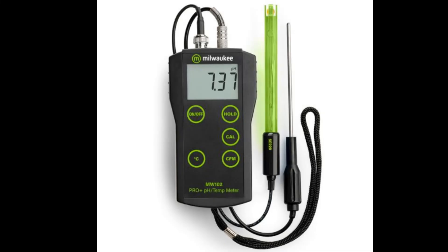Picture this: you're working on your latest homebrew, carefully measuring out all your ingredients, and suddenly you think, wait — is my pH right? That's where something like the Milwaukee MW102 Pro Plus pH meter comes in. We're going to deep dive today into this product description, basically a sales pitch aimed at brewers, winemakers, growers — anyone who needs to nail that pH.